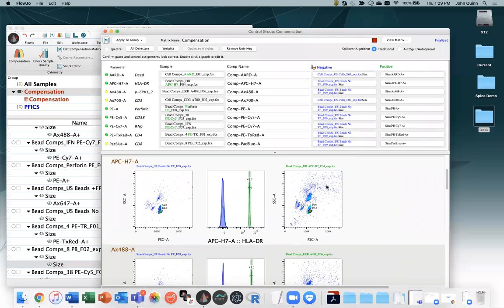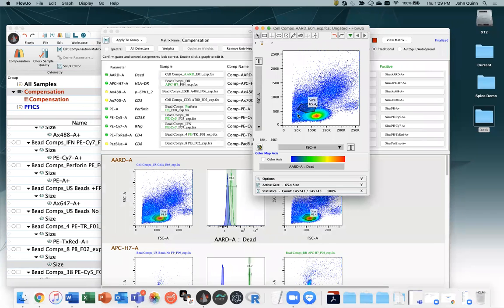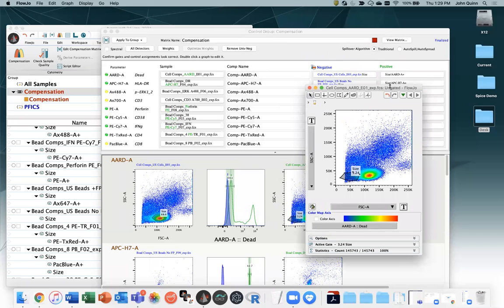So if you want to change one, and we've got a case we do want to change at the top, the live dead dye. The live dead discriminant here, well, we don't have a very strong positive peak, and we suspect that's because auto gating, where we're trying to identify a nice bright live population with lots of cells, has probably identified a population fairly lacking of dead cells. So I can double click on this plot and say, let's move our cleanup gate down to where there might be some dead cells. And sure enough, there we go. We got a nice big peak that's popped up.